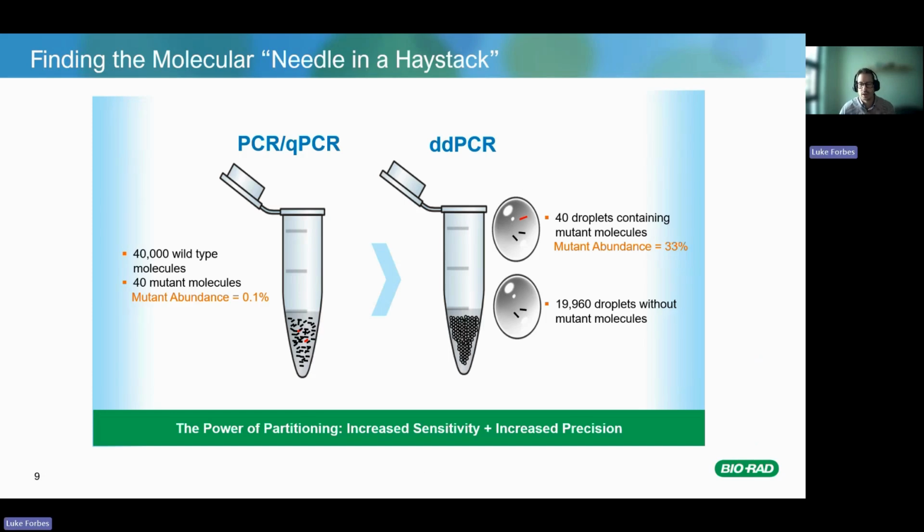So this is, I'm sure, a slide that you might have seen before, and it's sort of defined as, imagine if you're looking at needles in a haystack, and you have a metal detector. Now, if you wave the metal detector over your haystack, it will tell you that there's a needle there, but it can't tell you where the needle is in that haystack, or if it's one needle or 500 needles.